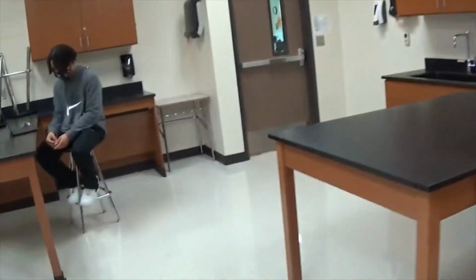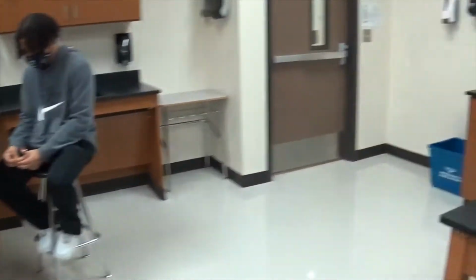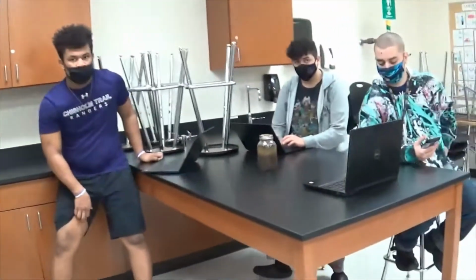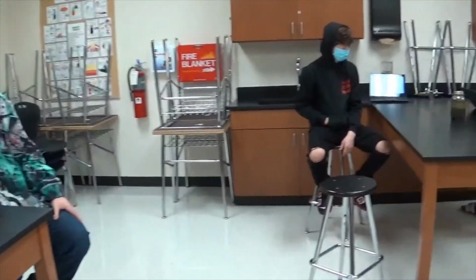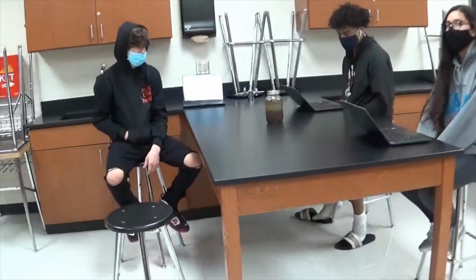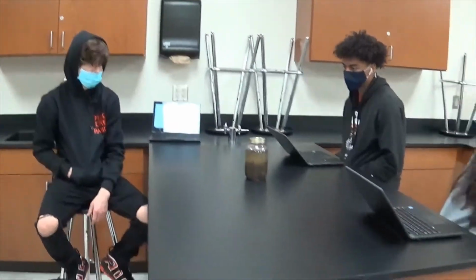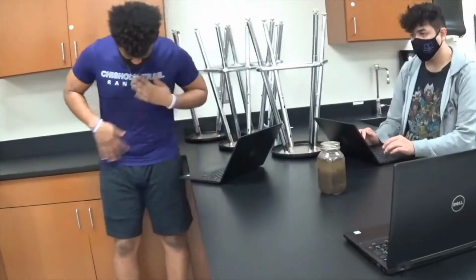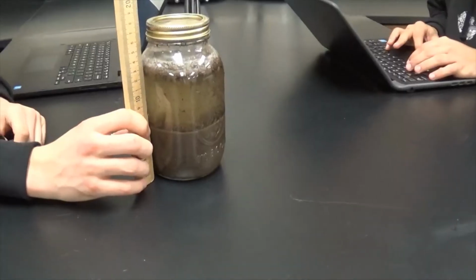After you've measured the height, you'll calculate what percentage of each sediment type is in your soil profile. And then use the soil triangle to figure out what type of soil texture you have. Okay, so let's go ahead and start our measurements. After you take a measurement, enter that measurement into your lab.